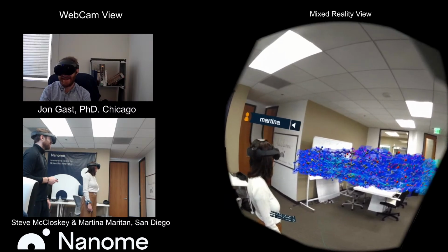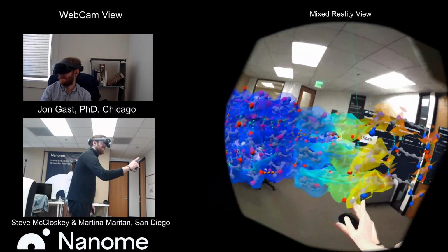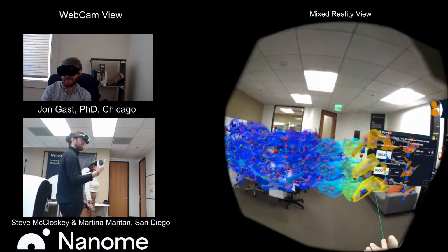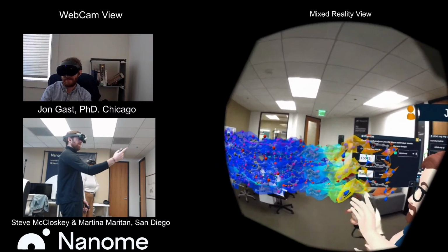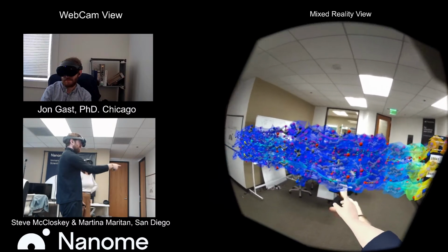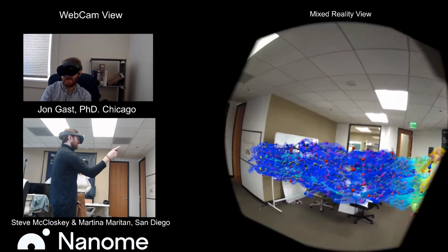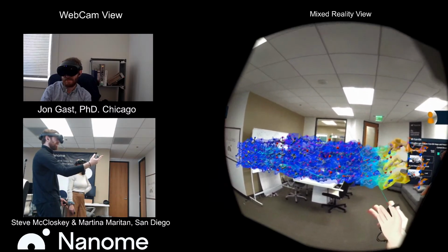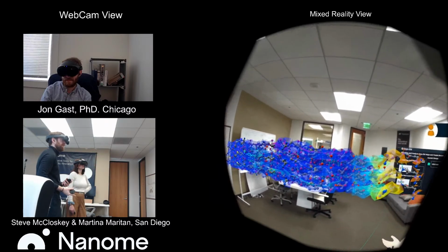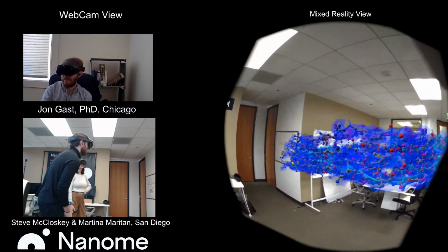You could visually see some of the accuracies here. But like John's saying, there is a person, a scientist, going in and solving this computational model with respect to the structure, and they're trying to get it as accurate as possible. We could do a visual check, like the other person mentioned. If you run RMSD to calculate between the map and the protein, that could give you a value. So there's a lot of ways to check, but this does look pretty accurate.